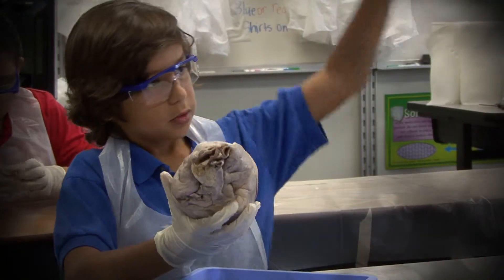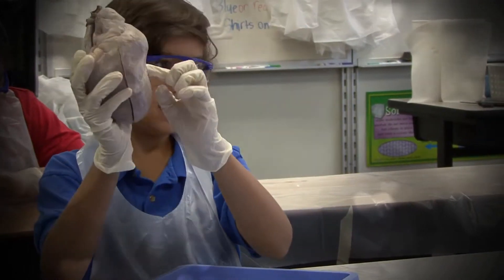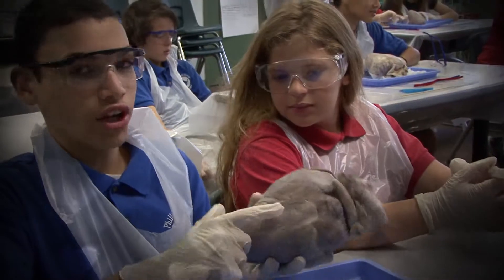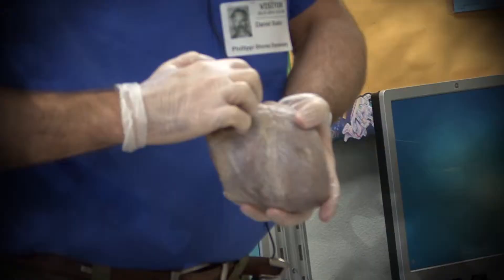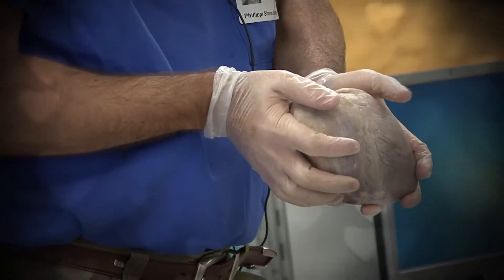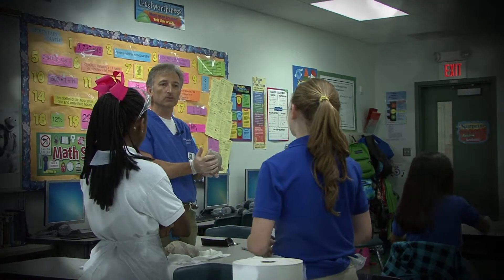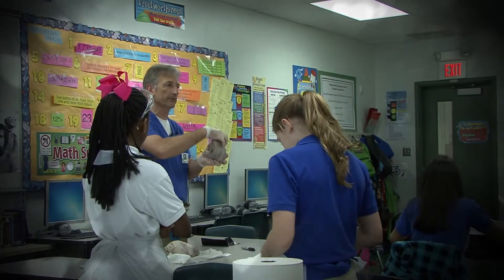Look for the coronary artery and the coronary vein — take your finger and follow it down. The coronary arteries supply oxygen to the heart muscle itself. The heart is busy supplying everybody else with blood and oxygen, but it needs to get oxygen too, so it gets oxygen from the coronary arteries.